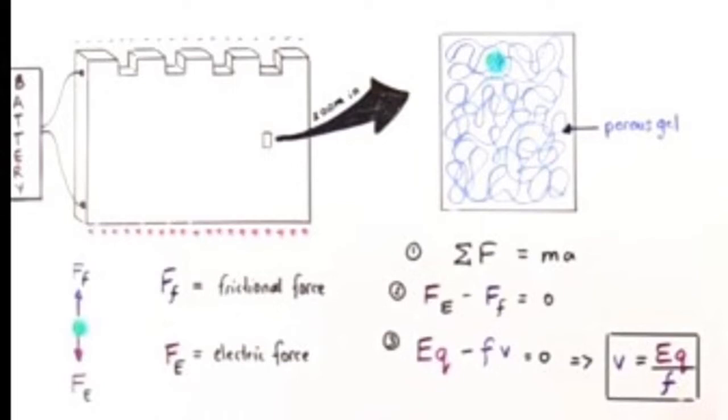So we are going to find that force when we get the electric field that is being applied on that device. We multiply by the quantity of the charge being applied to the device. So this is what we are going to use. We replace where we've put the FE.